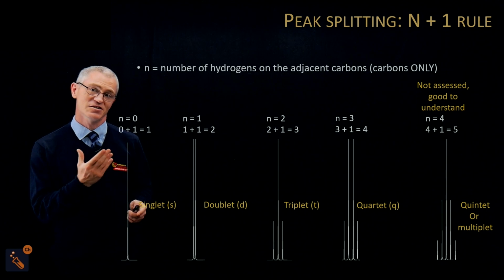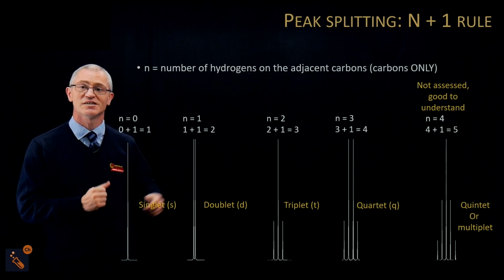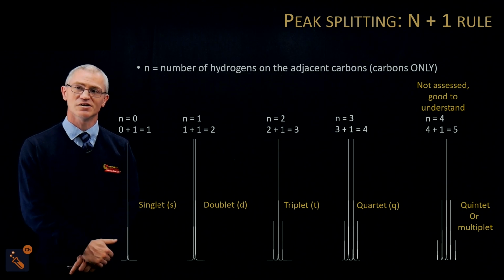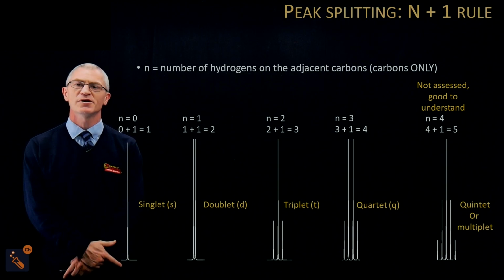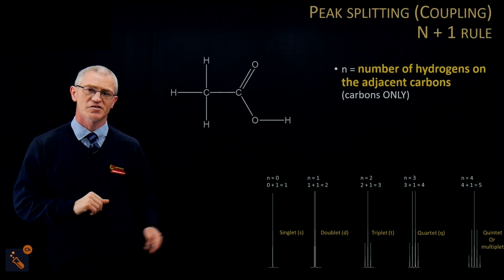So you're going to see it in a certain ppm, a certain chemical shift, which is what we've already done, and you're also going to see peaks coming that look just like this. So let's apply this to ethanoic acid. Move this down and put our ethanoic acid in.